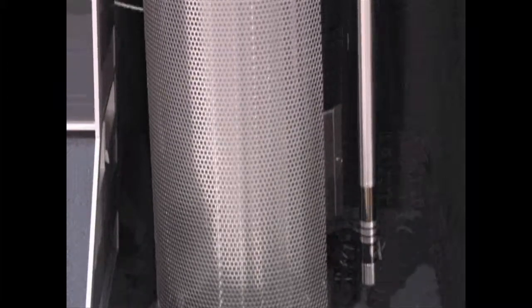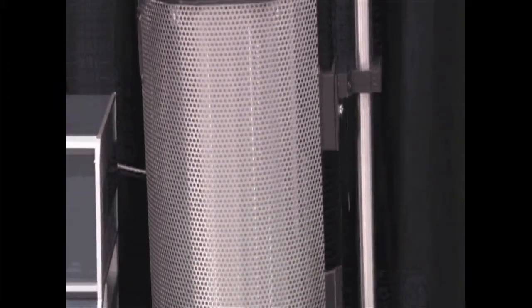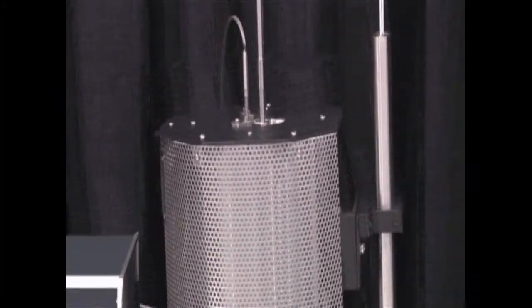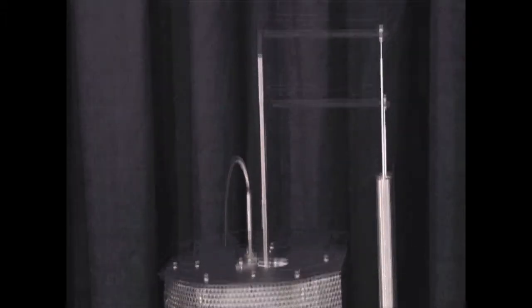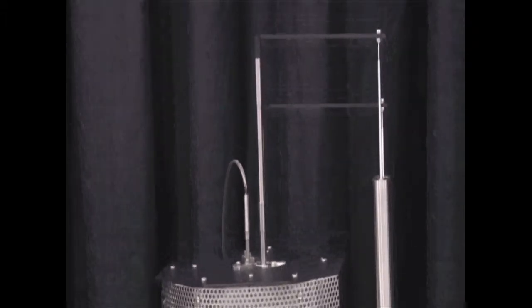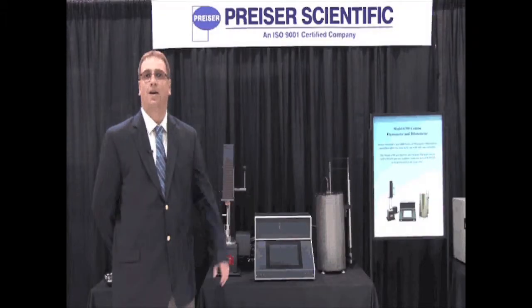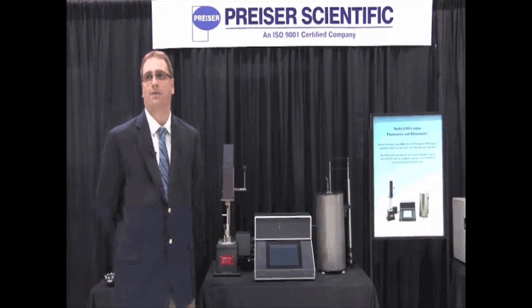The dilatometer is used to measure the swelling characteristics of the coal sample. We take the coal sample, we place it in the furnace, and we actually measure how much it will first contract and expand over a temperature range from 300 to 600 degrees.